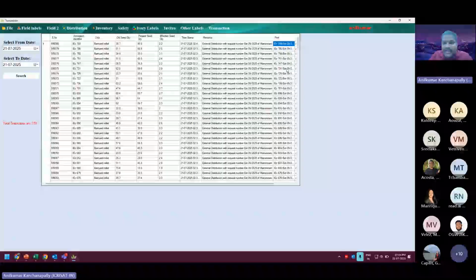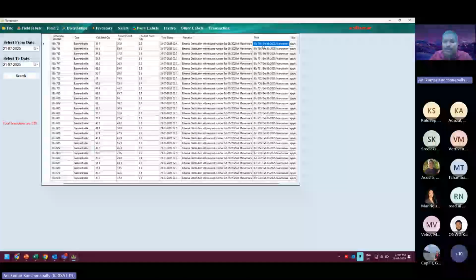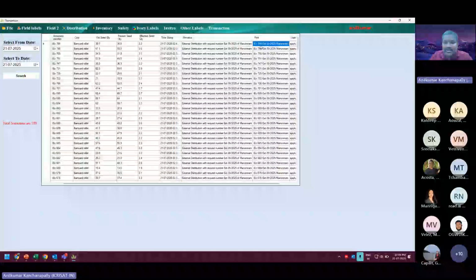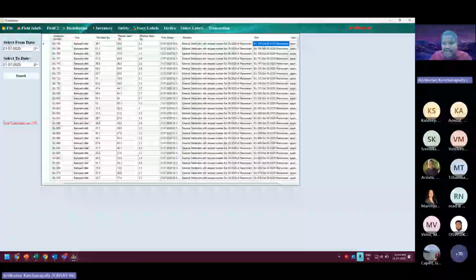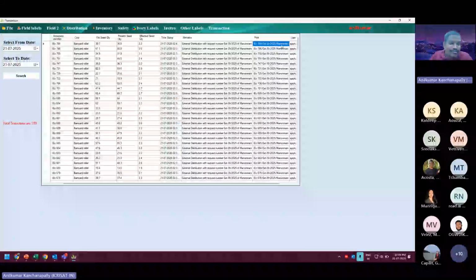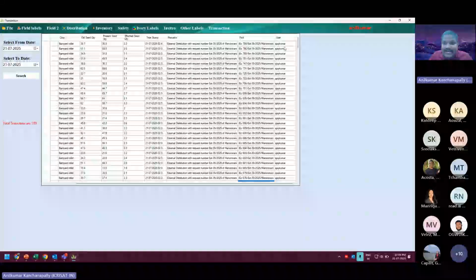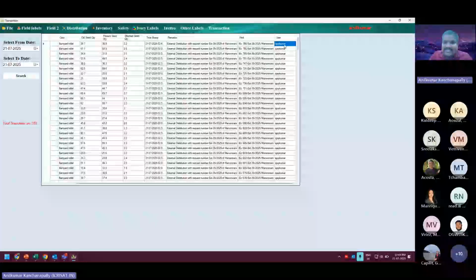And here you can find the barcode that we printed, the request number as well as the accession number, and the requester name. The requester name also comes in the barcode, and who inventoried this accession using the QR code application.